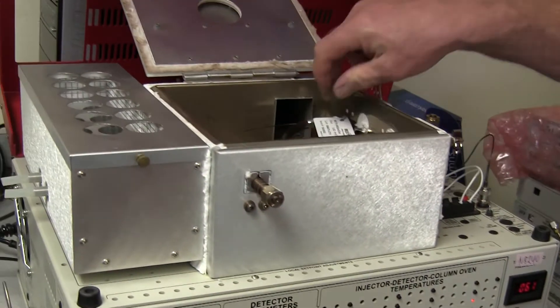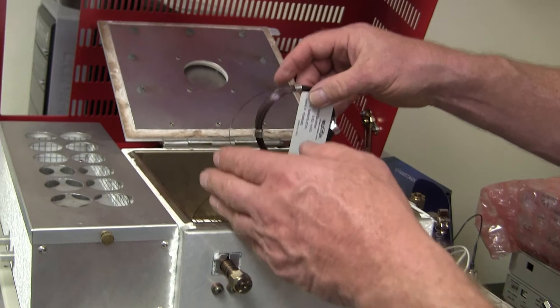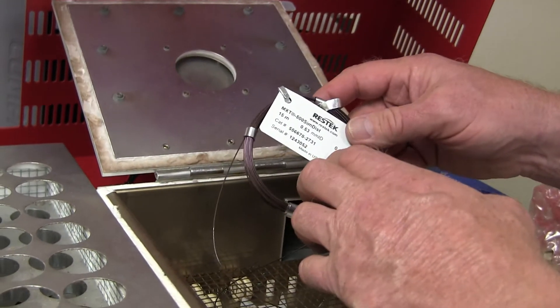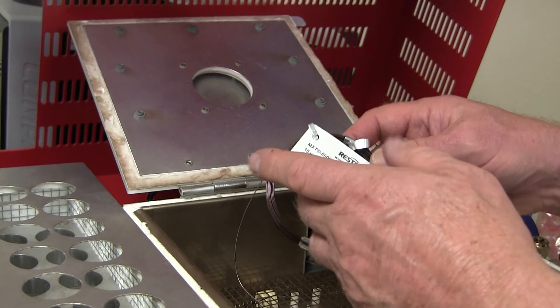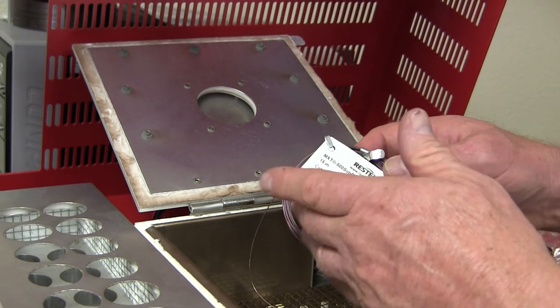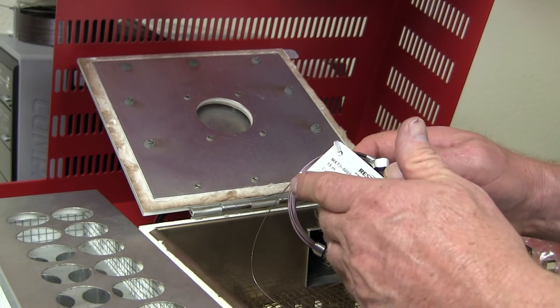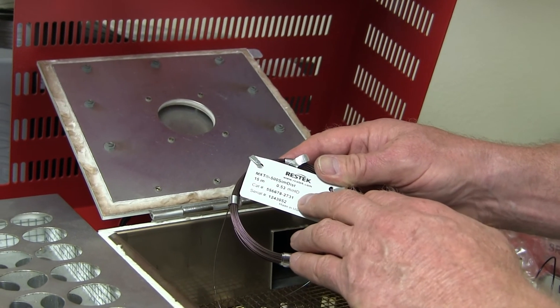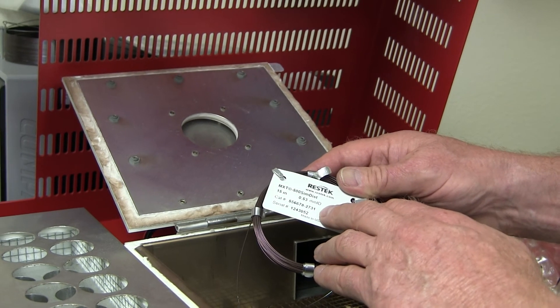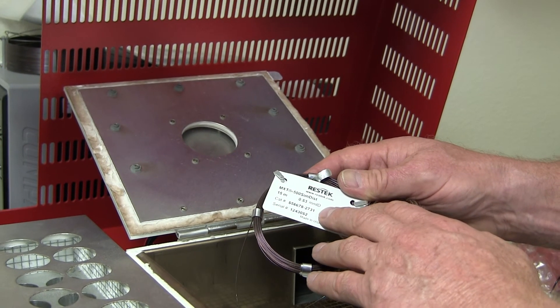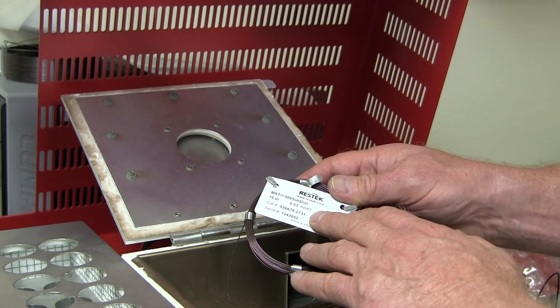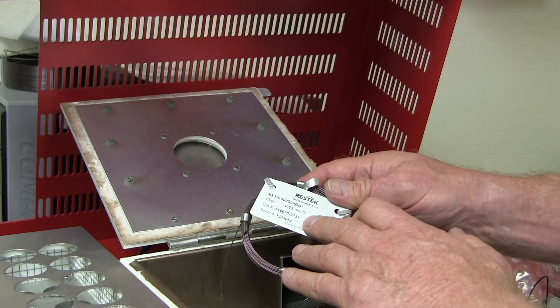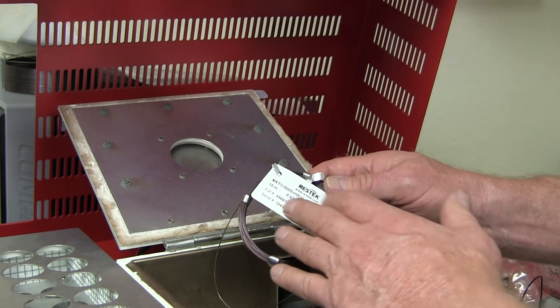To bake out the column, as distinct from baking out the polishing filter, you're just going to set the column oven temperature somewhere close to the maximum temperature of the column, but not at the maximum temperature of the column. If this one, for instance, was set to 350 degrees, you wouldn't want to bake a column out that only had a 300 degree maximum temperature limit at 350 degrees because that would probably damage the column.